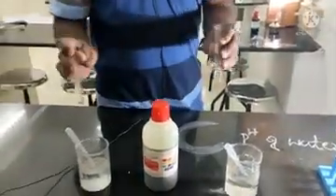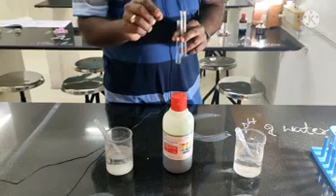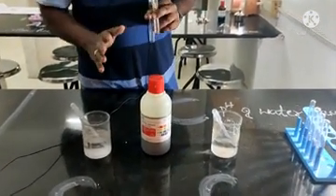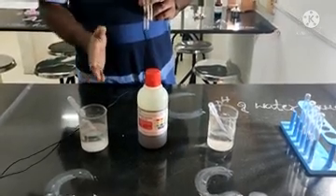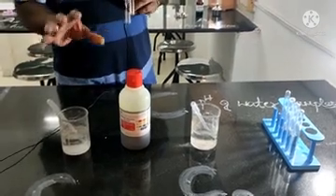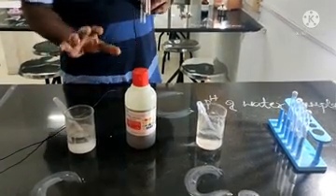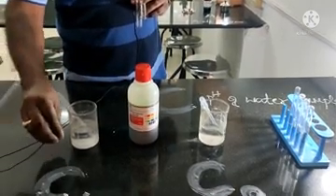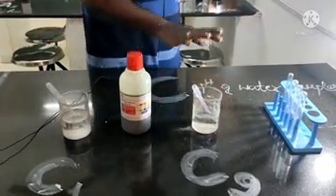After conducting this test, you have to draw a tabular column where you write down the C1 sample based on the pH color. You are going to write the pH values, and based on that, identify what type of sample it is. If the value is less than 6.9, it will be considered acidic. If the pH value is more than 7.1, it will be considered basic. After writing all these things in the tabular column, the student compulsorily has to write a report about this experiment. That is, you have to say in your own sentence what C1 is. If C1 is acidic: the given C1 sample is acidic and the given C2 sample is basic. So these are the aspects with respect to the C experiment.